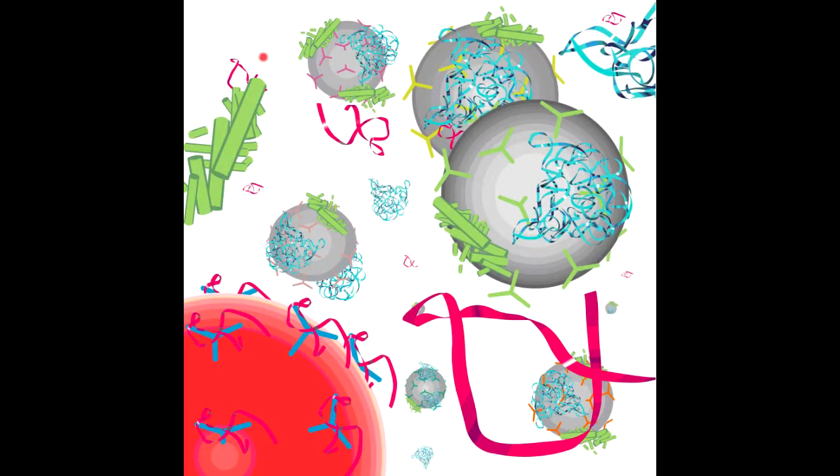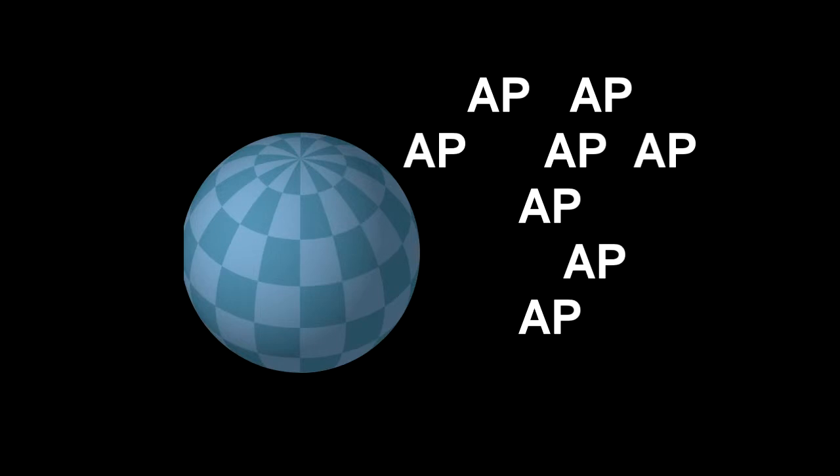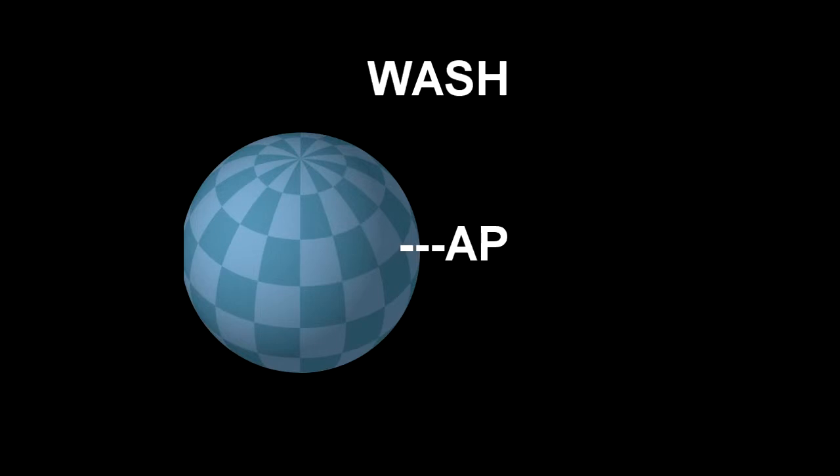But what if there was a vessel on which we could originate our growing peptide chain? And what if this vessel was insoluble to the solvents used in each reaction step? Now we can distinguish our peptide chain from all the other things that we have added into the reaction vessel. This is the fundamental idea of solid-phase peptide synthesis. Instead of a solution reaction, beads that are small, insoluble, and porous are treated with functional linkers, where peptide chains can be built. If we saturate the reaction vessel with protected amino acids, we can wash the beads after the reaction has occurred. This will result in our growing peptide chain being attached to the beads.